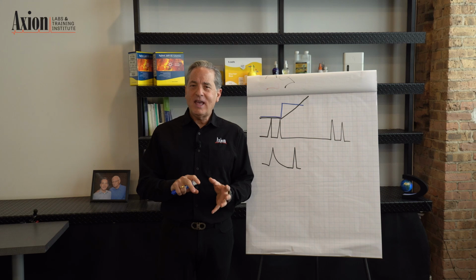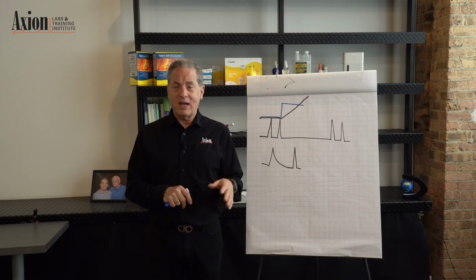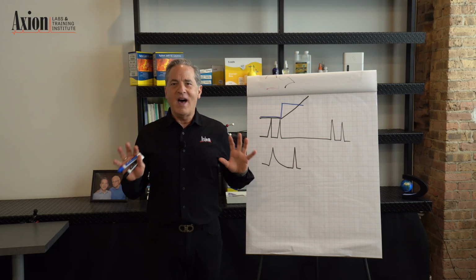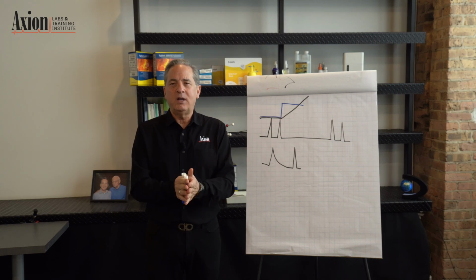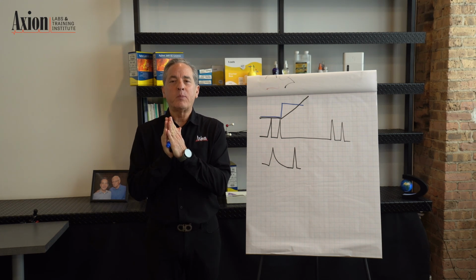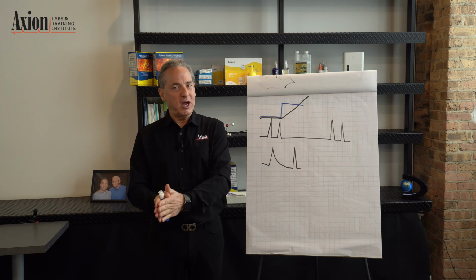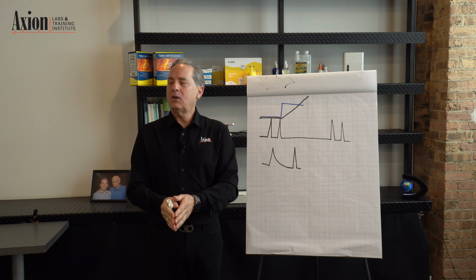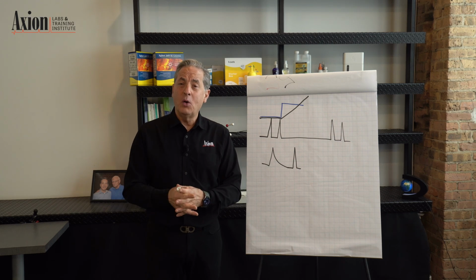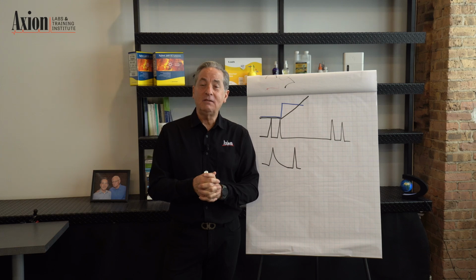So in this case, I really think step 1, you need to clean out the instrument because if we're getting extra peaks, that shouldn't be. And then step 2, let's evaluate. Let's look at the instrument. Take 1 vial, inject it 6 times. Look at the reproducibility of the peak areas, peak heights, and the retention times. Area and height tell you everything you need to know about the autosampler, and retention times tell you everything you need to know about the pump. So do that, and it should solve your problems.